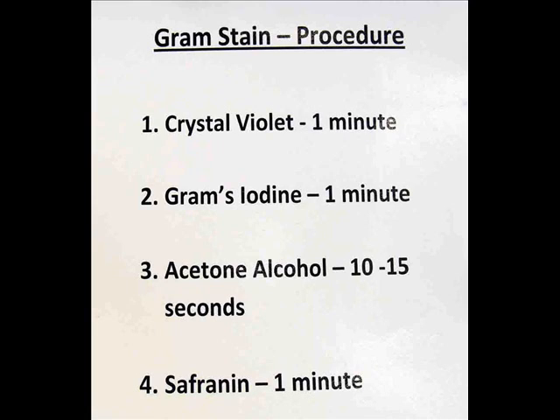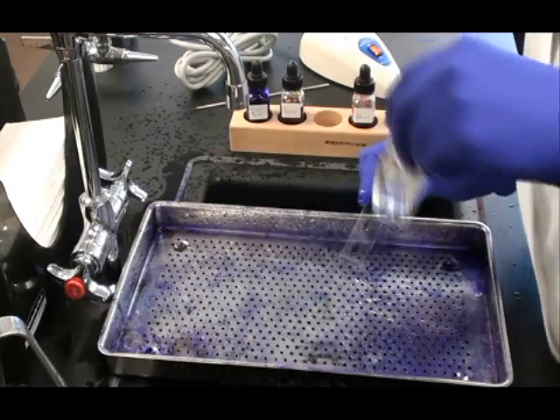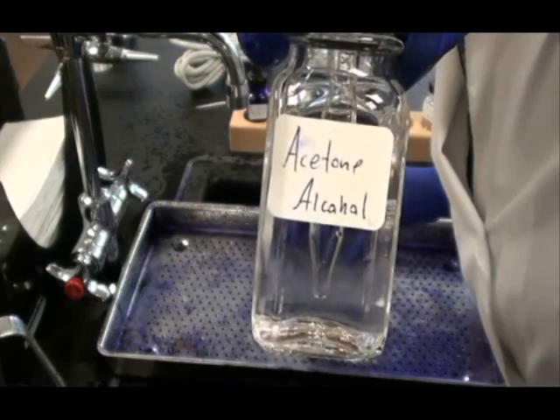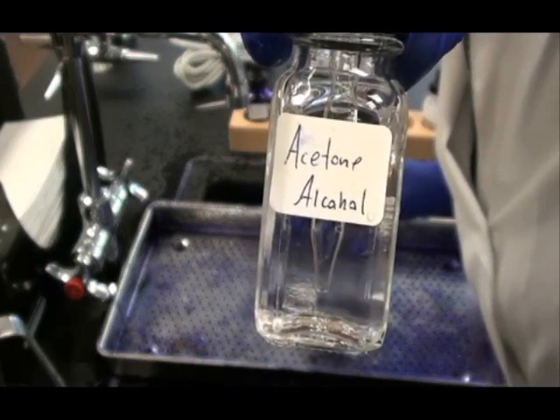My next step is to apply the decolorizer, acetone alcohol. What this step will do is remove the purple stain from my Gram negative cells. Here's the decolorizer.